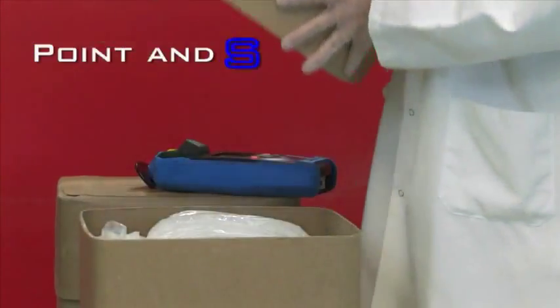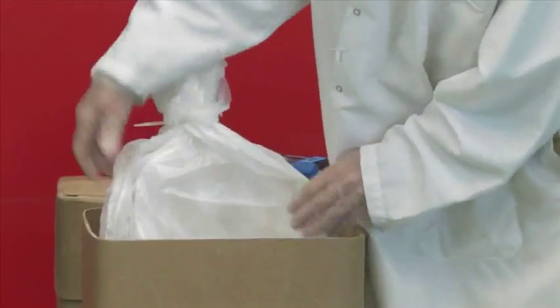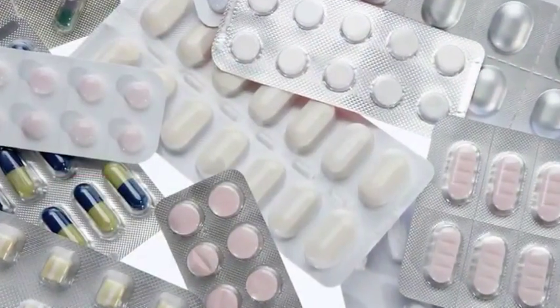TruScan's point-and-shoot operation enables sampling through packaging, such as double-bagged pharmaceutical ingredients in a drum or tablets in a blister pack.